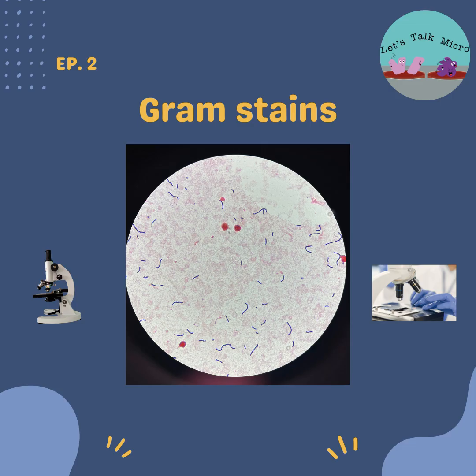Is it selective? Is it differential? What kind of media is it? Well, we know it's not selective. It can pretty much grow every organism, but it is actually differential, right? We can observe the types of hemolysis in it, like your alpha, beta, and gamma hemolysis. And you remember what hemolysis is, right? Hemolysis is the lysis of red blood cells in the agar. We have alpha, beta, and gamma, like I just mentioned.